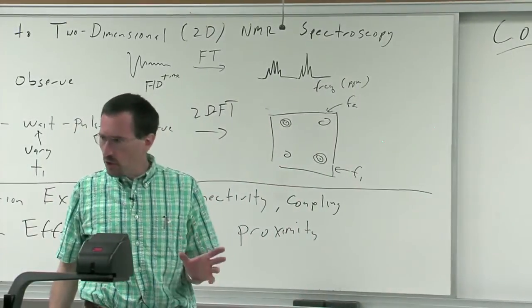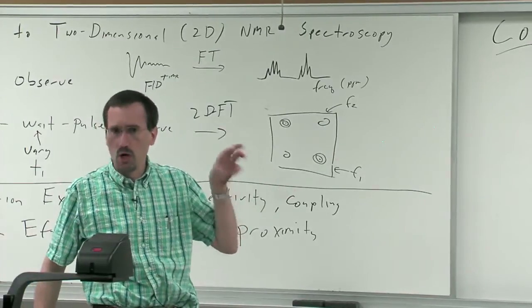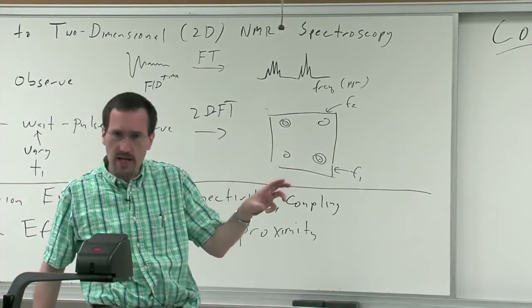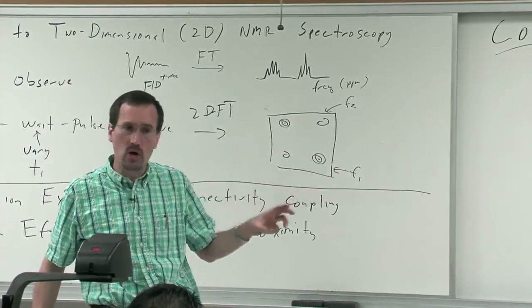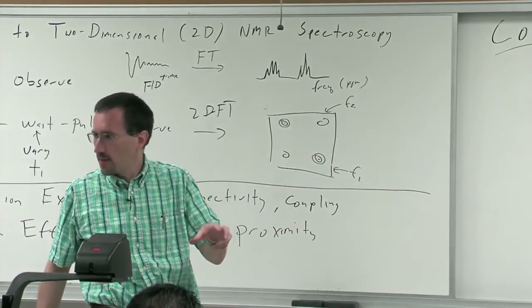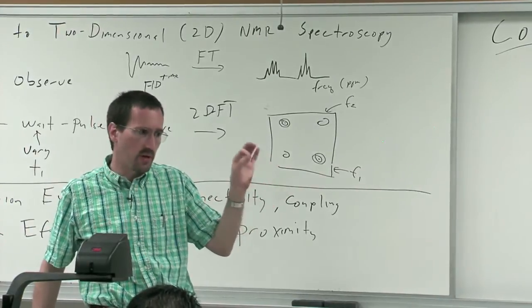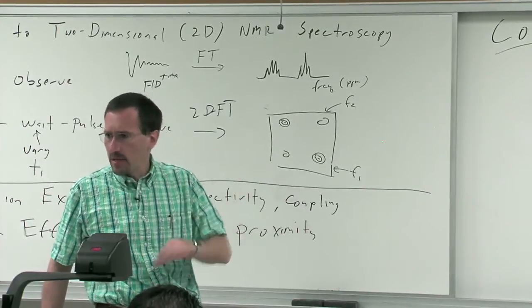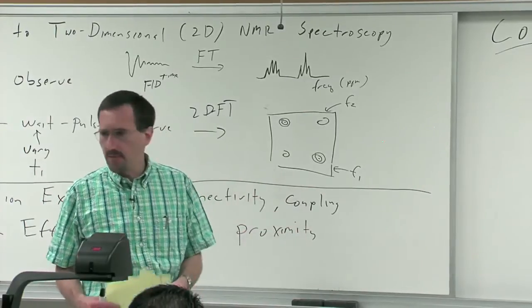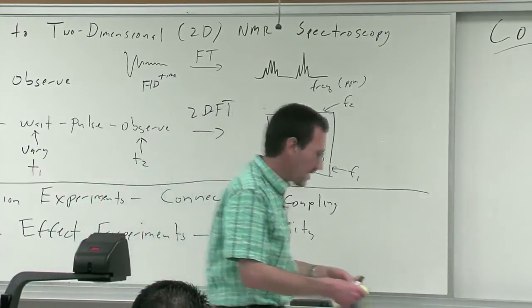Then you'll be able to say, here's a hole in my tools where I have a very specialized problem that isn't being solved by these tools. And you can go to Phil or go to the NMR manual and say, I'm encountering this particular problem with a COSY, and a TOCSY isn't helping me out, but I remember him saying there was some technique called a relay COSY, and I can add that to my toolbox.